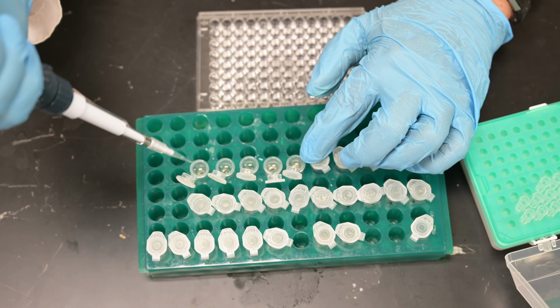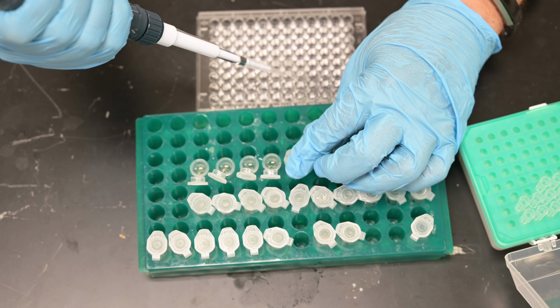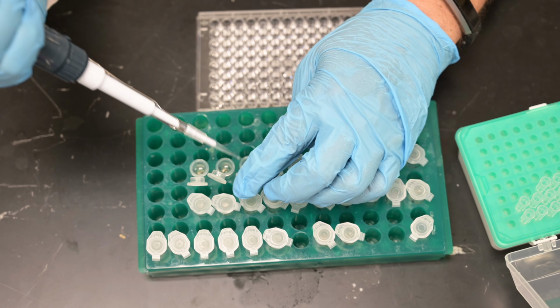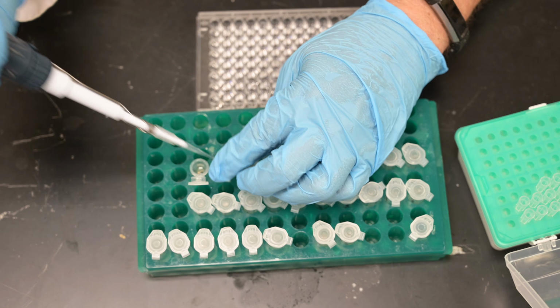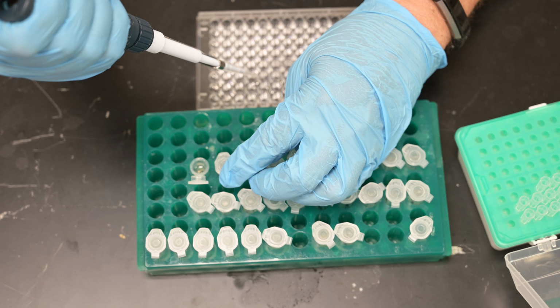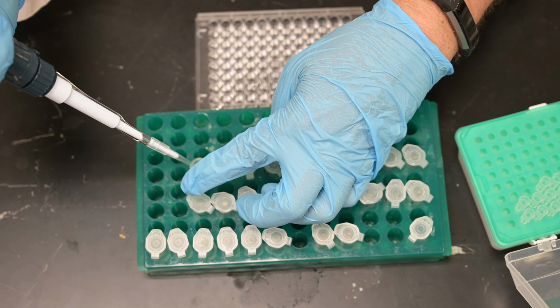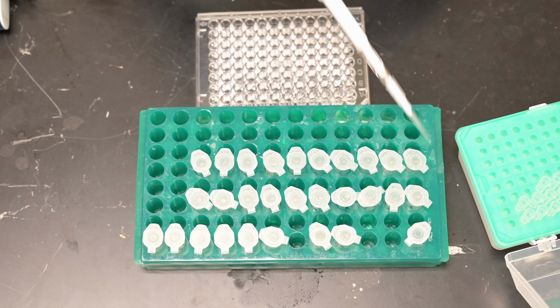Next, the 0.6 molar washes. Number 1 goes into C6, 2 goes into 7, 3 goes into 8, 4 goes into 9, and, oops, and 10. Okay, so now I've loaded them all the way across.